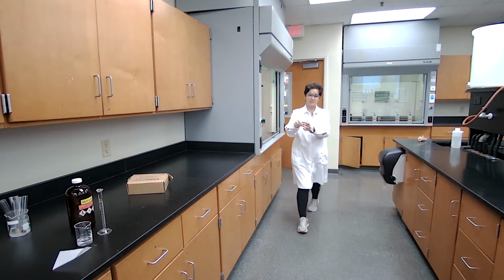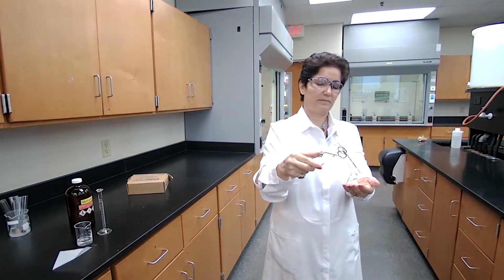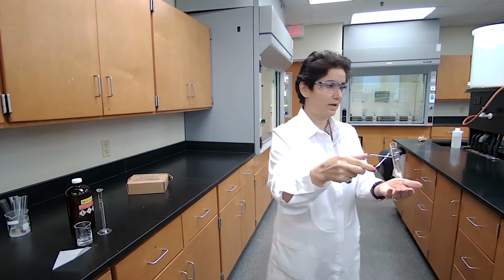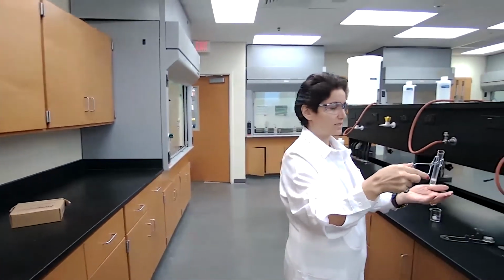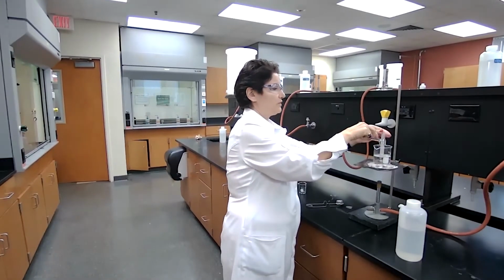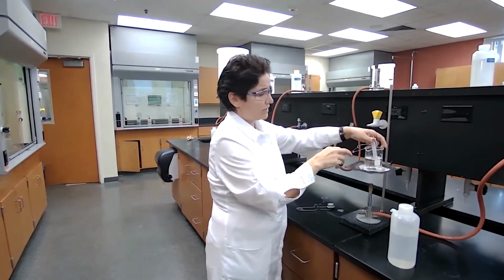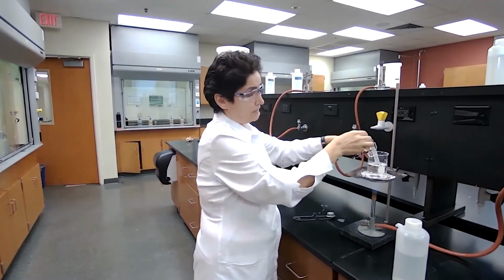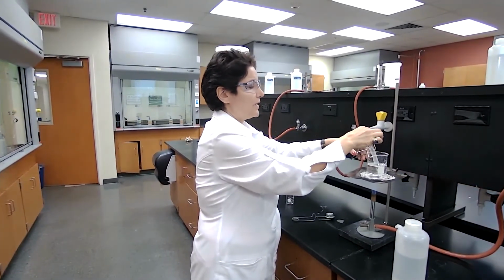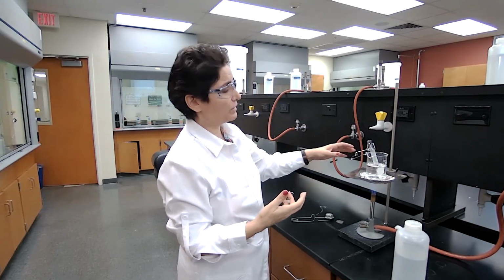And when we have the mixture, we place the mixture of the acid, alcohol, and the carboxylic acid, which in this case is the salicylic acid, in water, and we wait for 10 minutes. For 10 minutes the reaction would be complete. When the reaction is complete, it has a very strong odor.